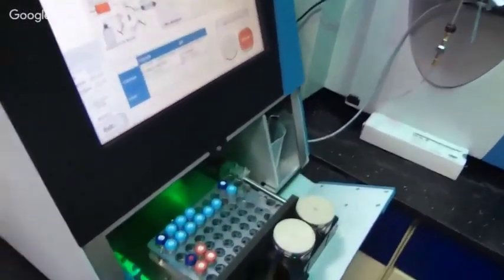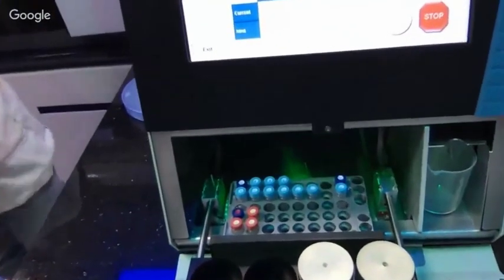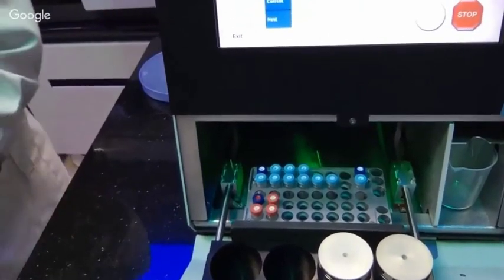This is a place where you want to keep your samples, and the idea is that you can have almost 96 samples possible for injection. So you need to have the peptides in a very concentrated form, right? Because you want to know both the quantity, how much you have, and the volume which is specified, which you want to inject. So only a few nanoliters or microliters volume you want to inject here.